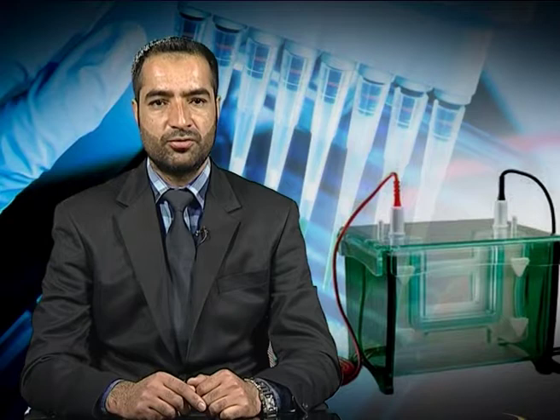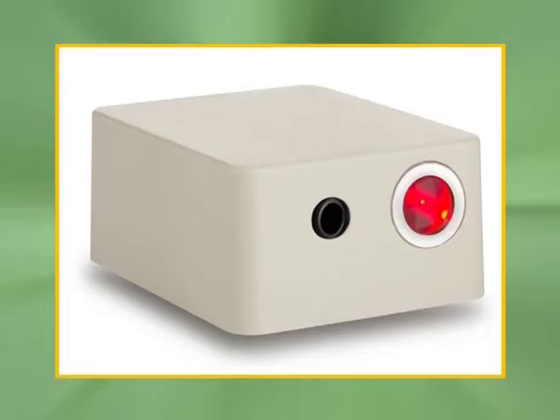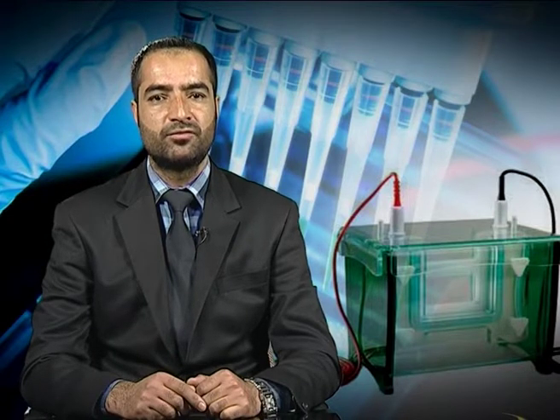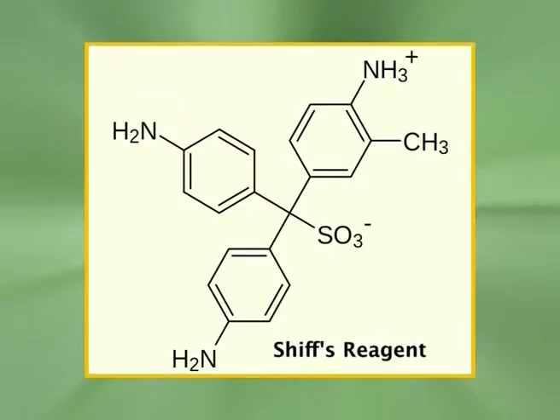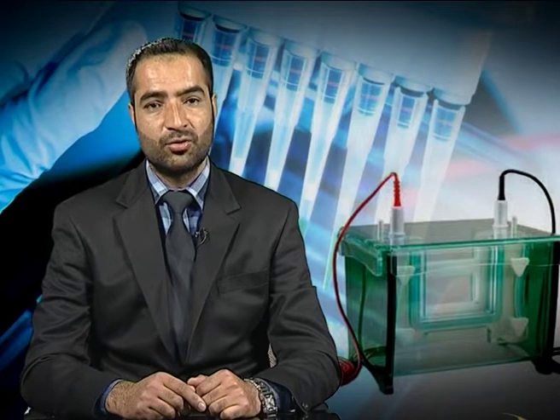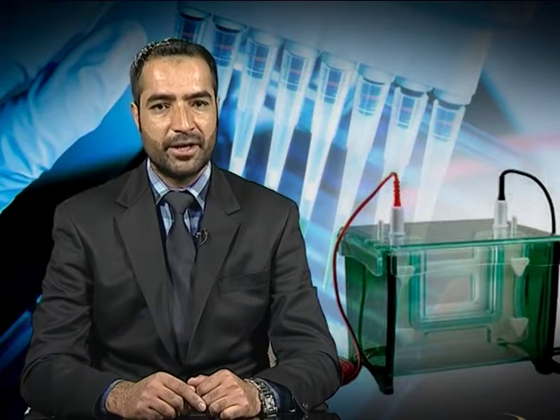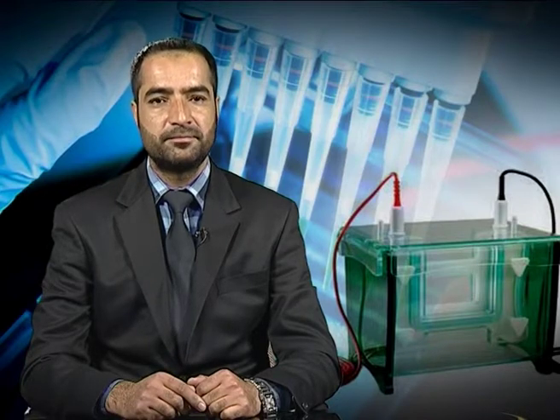Cellulose acetate strips are translucent and this makes them suitable for direct photoelectric scanning for separated bands of components. Because of the very low content of glucose, these strips are suitable for electrophoresis of polysaccharides. Upon staining by Schiff's reagent, background staining is negligible. Cellulose acetate is not hydrophilic and thus holds very little buffer. This property is conducive for a better resolution in a shorter time.